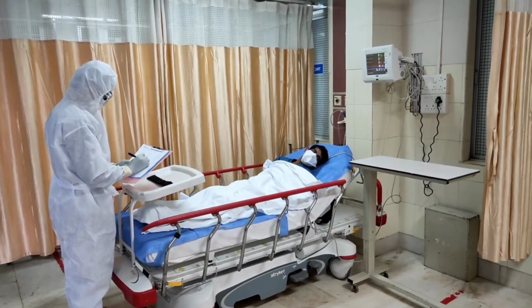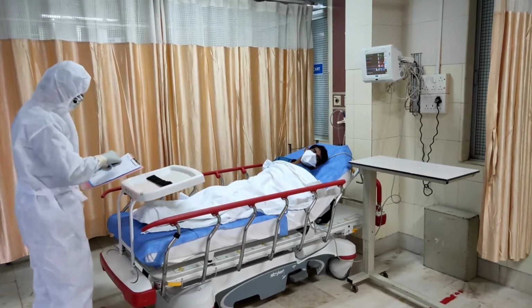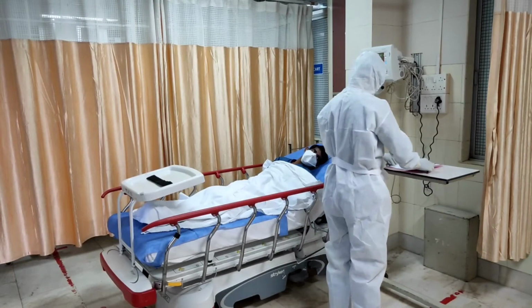Once you are ready to come out of the decontamination unit, first make sure that you put away all the equipment and things that you are using inside into a secure place inside the decontamination unit itself.